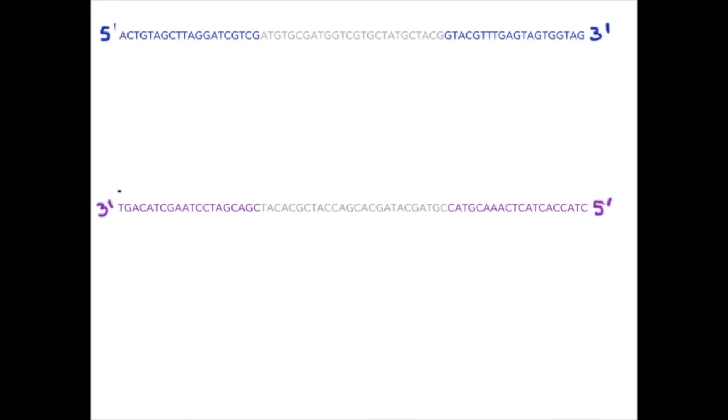We next design our first primer, the one that will anneal here at the bottom strand in this direction. We label the arrow here with 5' and 3'. Based on what we see, it is now easy to design a sequence that is the reverse complement of the sequence that we see appearing in the bottom strand. We label the ends, 5' on the left and 3' on the right, just like in the arrow above.